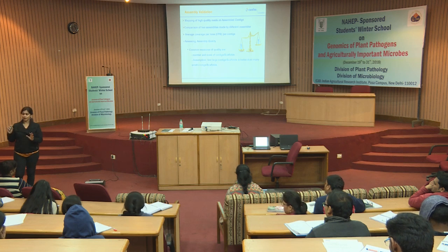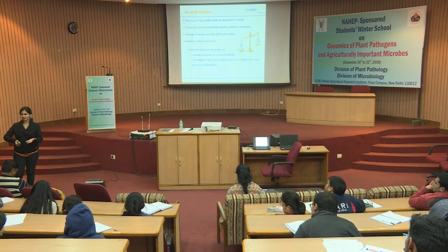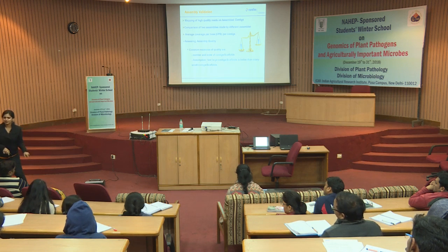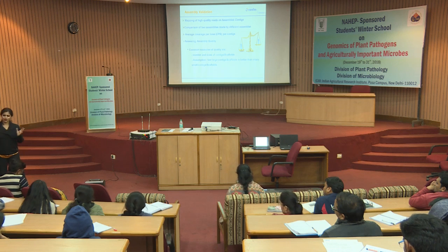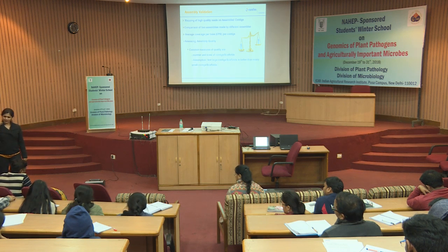If I am only doing PacBio sequencing, then I do not have anything to eliminate. I will eliminate based on quality and all those things and then use it. So, I cannot differentiate whether the indels are from that particular platform or whether they were there in the sample, right. So, that is why hybrid approaches are good if you are going for complex organisms. Short reads can be used to eliminate those errors of indels, so that I filter out in the beginning itself and then use those reads in filling the gaps.